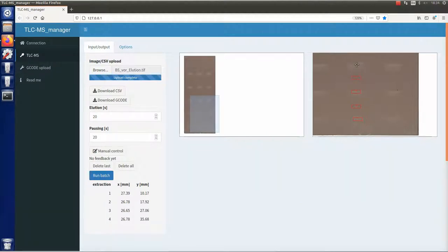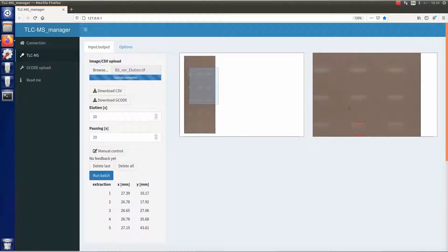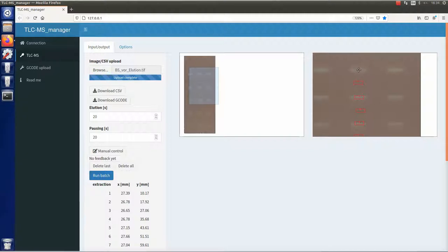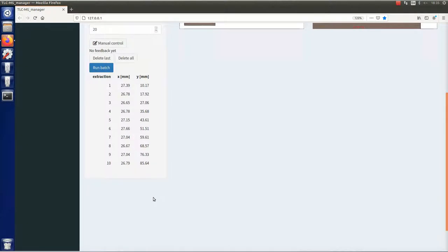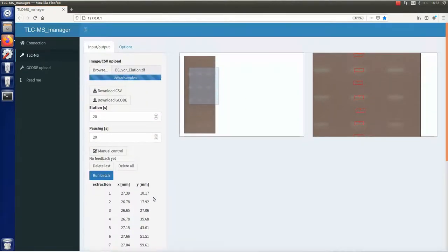The zones for elution are simply chosen by clicking on the bright bands on the enhanced image. The chosen elution zones are then translated into a batch displayed on the bottom left of the screen.